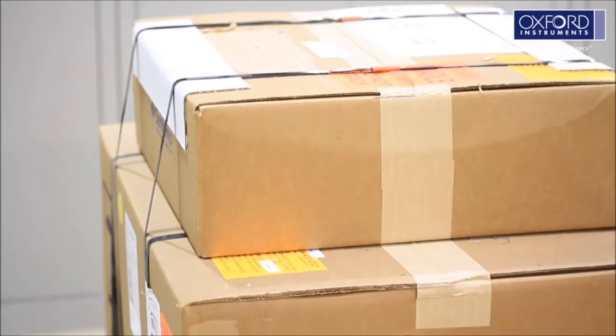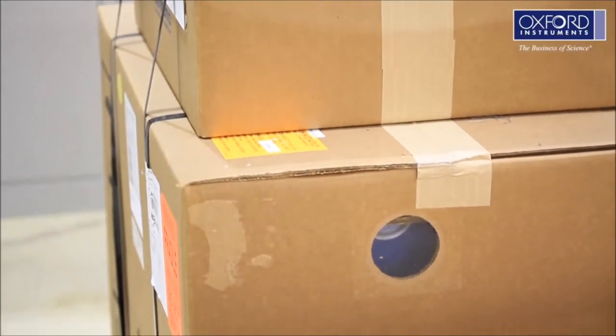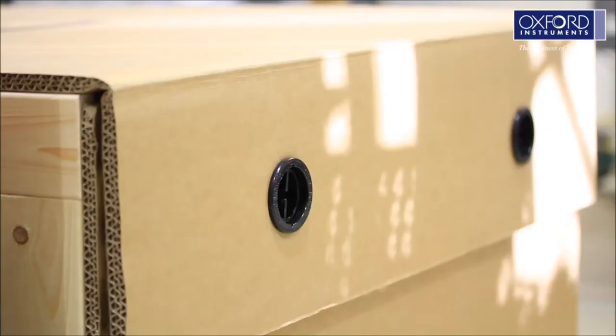Box 2 contains the compressor and the helium lines. Box 1 contains the cryostat and all the optional accessories you have purchased. This box must be opened first.